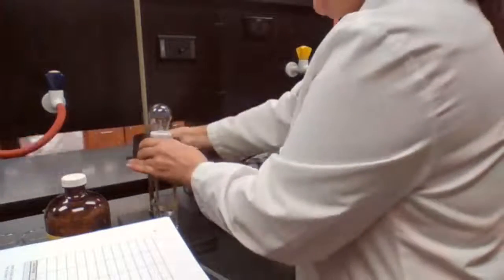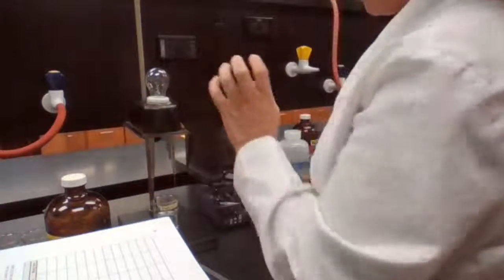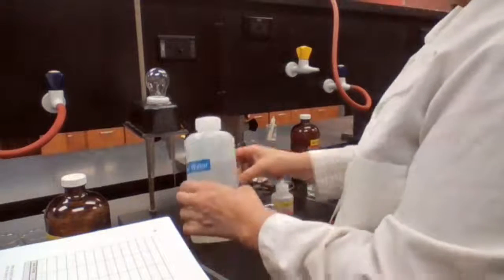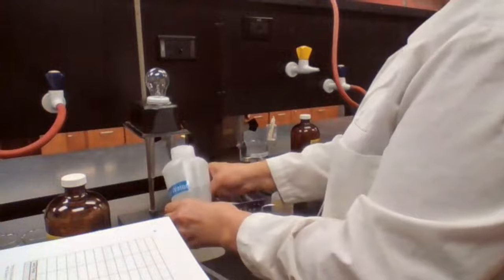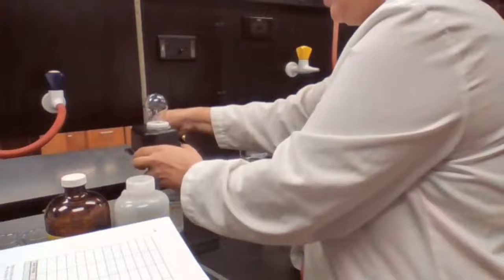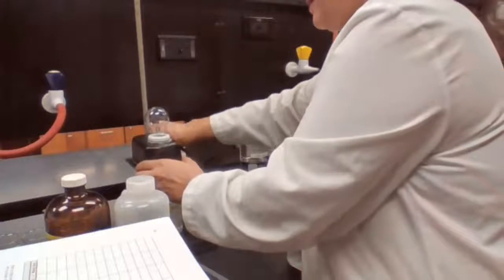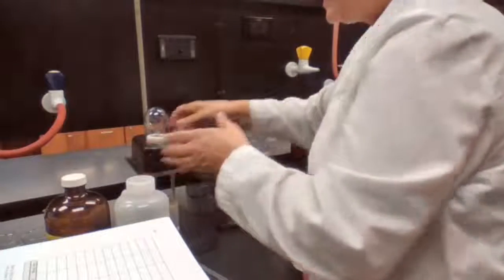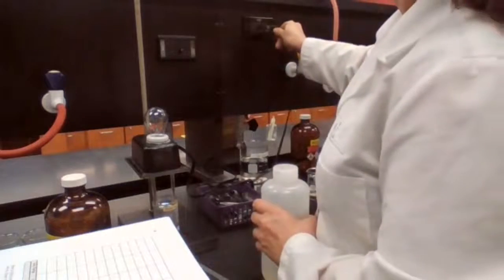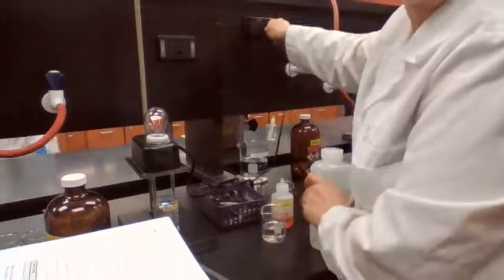Now aqueous acetic acid means that I have that acetic acid. I'm going to add some DI water. When we add water to acid, the acid is going to release hydrogen and the acetate ion, so it is expected to have a dimmed light.